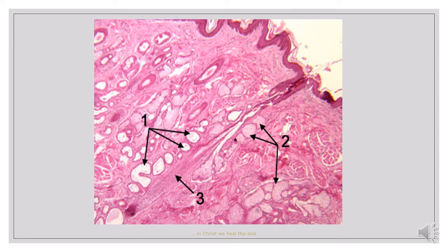We start with the slide of the lip. The lip is the outer part of the oral tissue and it has two parts: the skin side and the vermilion zone. These two parts are demarcated by a rim of pale skin known as the vermilion border. This border might not be distinctly identifiable in the epithelial part of the lip because both the skin side and the vermilion zone have keratinized stratified squamous epithelium.